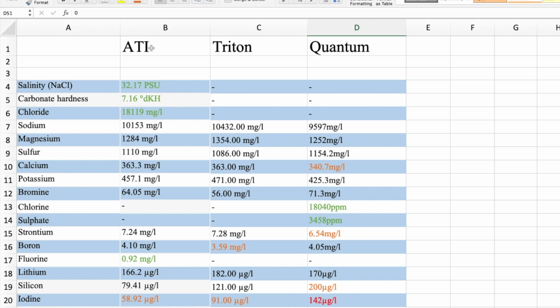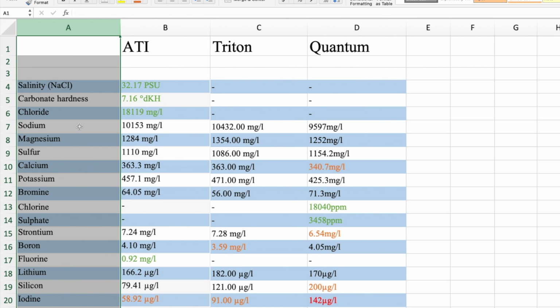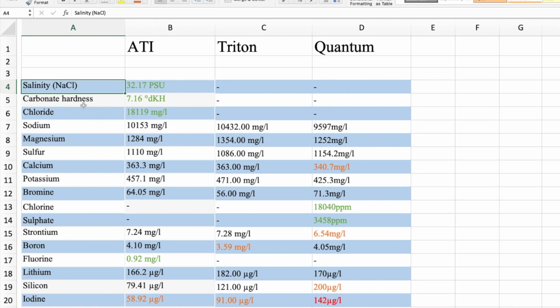So we've got our ATI, Triton, and Quantum columns, and down here I've got the elements they've tested. If there's a dash here, that means that these brands didn't test them. If there's a 0 or a U, that means that they do test them, they just were undetected. All right, so let's start off salinity.